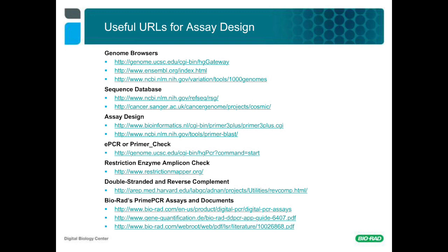So our next question is regarding restriction digest. You mentioned restriction enzymes can be used to digest the DNA. Would you recommend QIAshredder to shear DNA? Actually, we don't, because fragmenting your DNA randomly will also randomly fragment your target of interest and can actually cause you to quantitate much less than is actually present in your sample. So no, we don't recommend that.